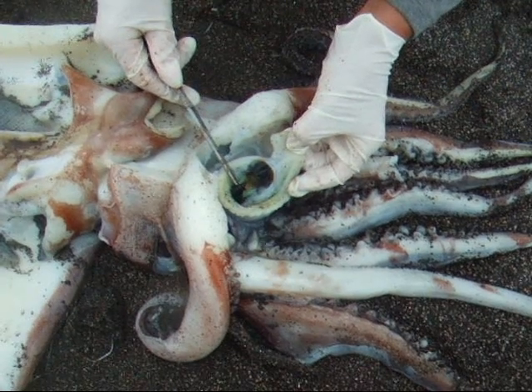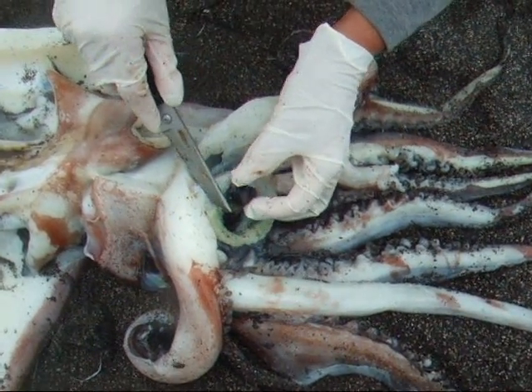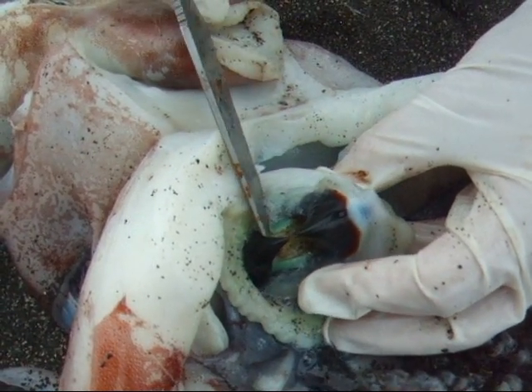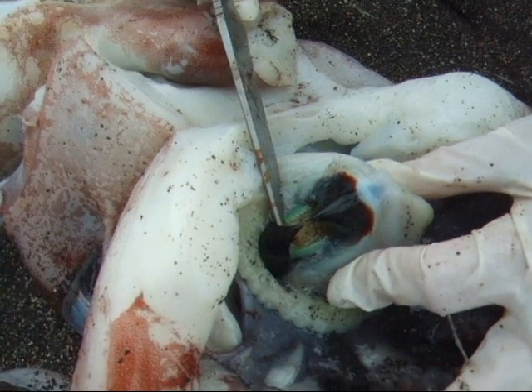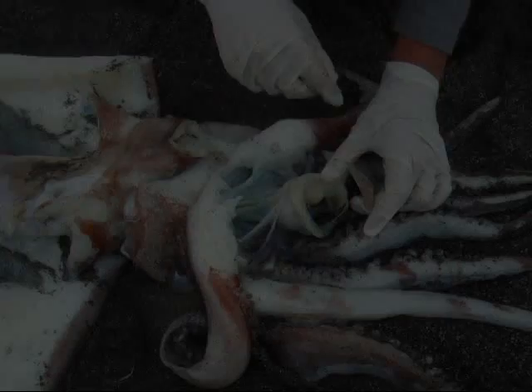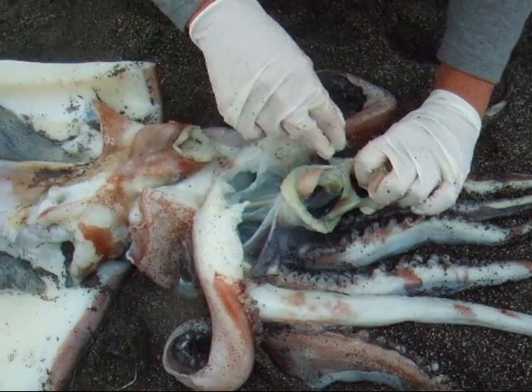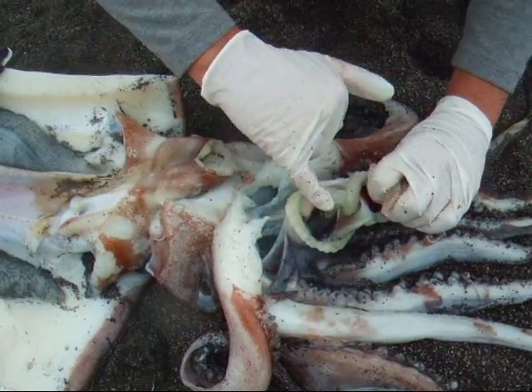I've pried this structure open and you can now see inside there is another structure. What are these little structures in there — the yellow ones? I've opened up this cavity a little more and taken off the top portion so you can see this structure a little better now.